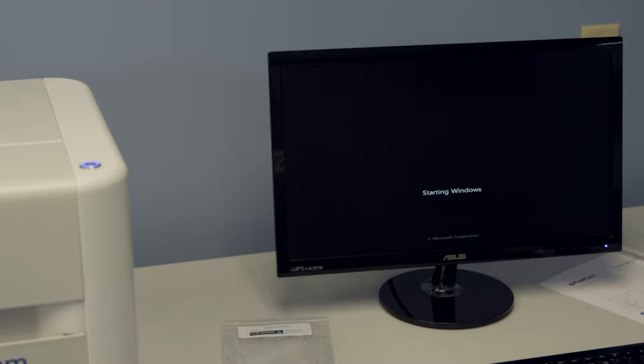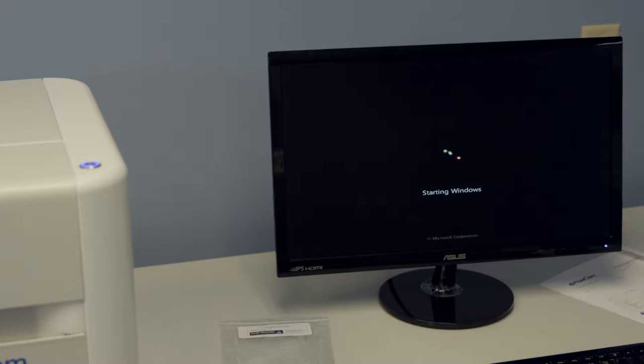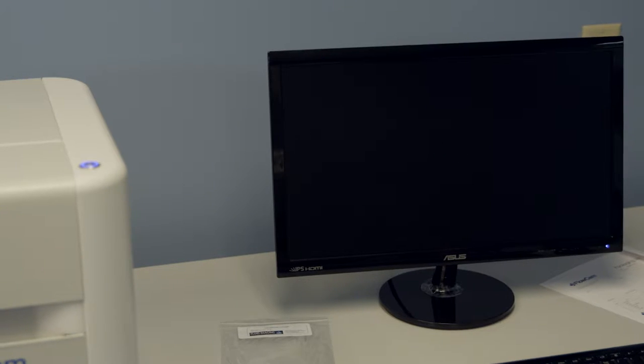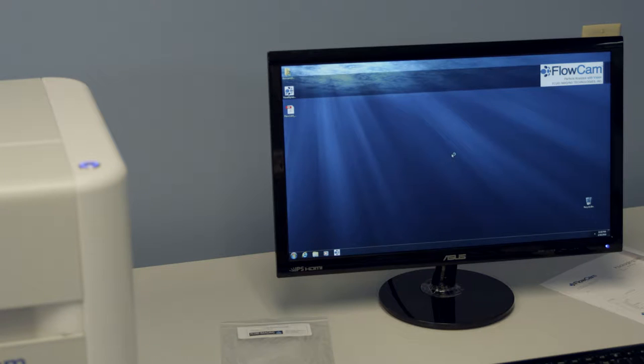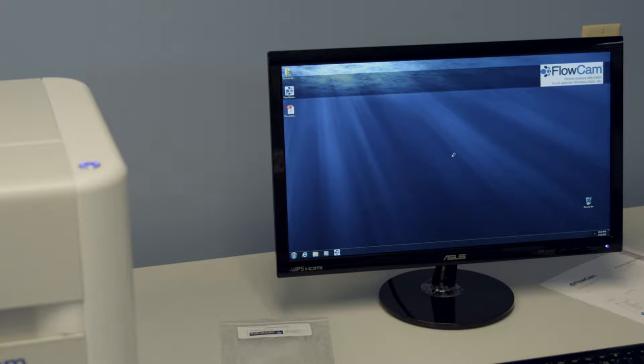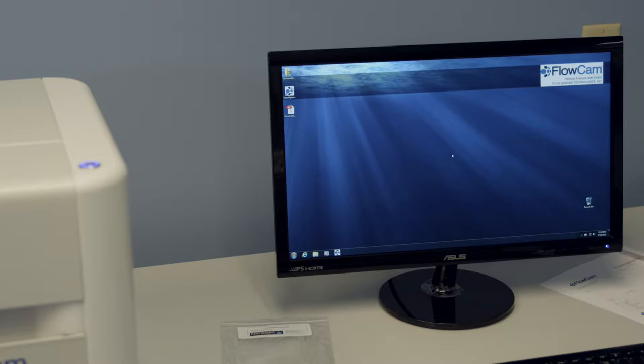After a few moments, the system will load into the Windows desktop where you will have access to the computer that is built into the 8100. Visual Spreadsheet is the program that will operate the 8100, which we will cover later on.